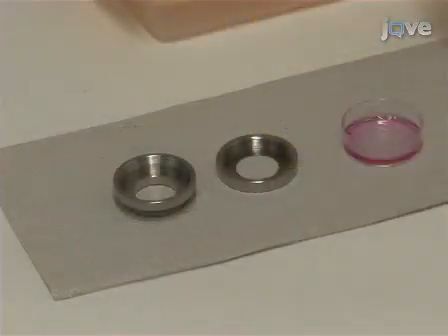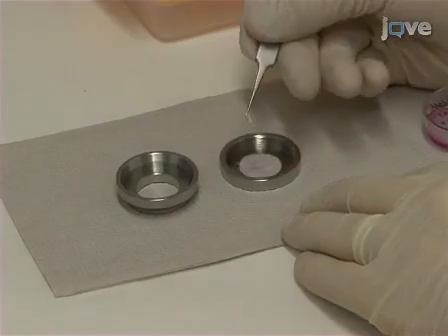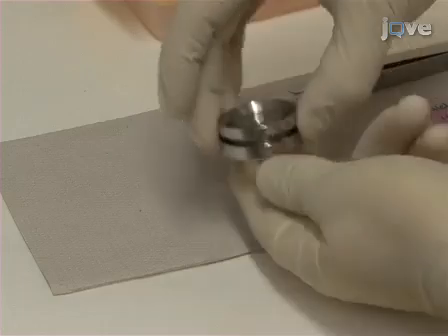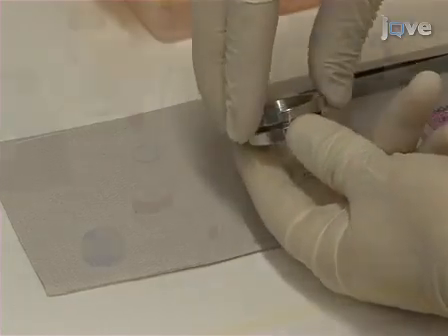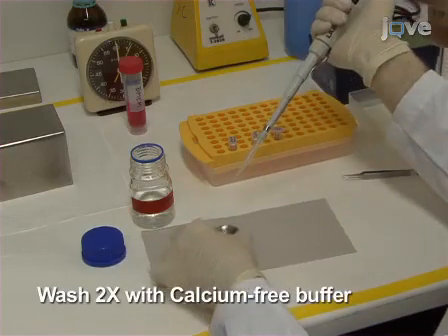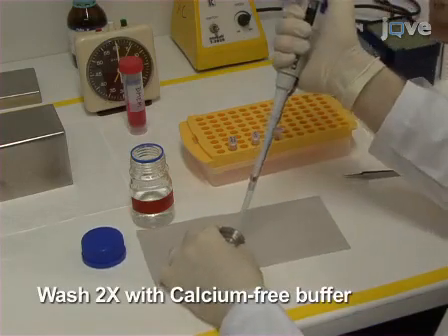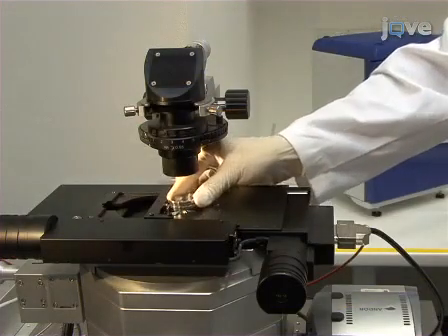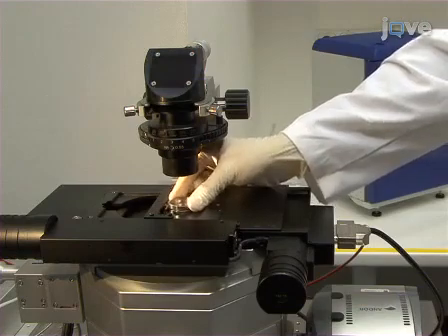To perform imaging, transfer the cover slip with the Fura2 loaded cells to a metal recording chamber and fix it into place by screwing the two parts of the chamber together. Using a pipette, add and remove 300 microliters of calcium-free buffer to the cells to wash them. Repeat. Then, mount the recording chamber on an iMic microscope with polychrome 5 chromator.